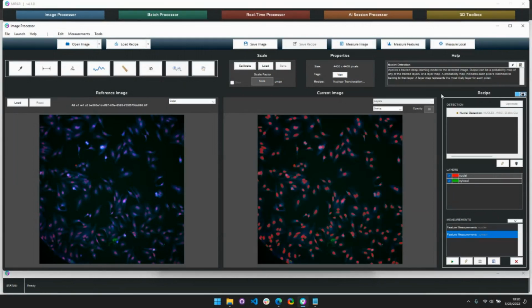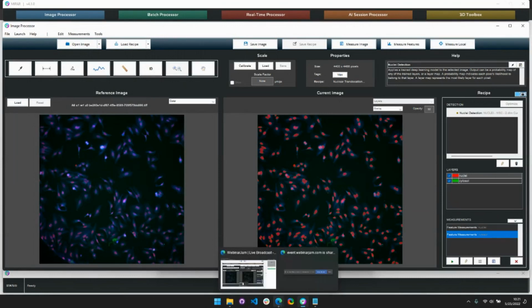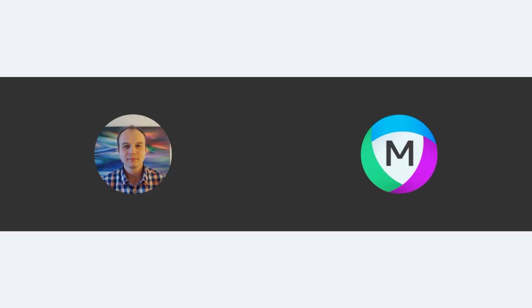You're also free to explore putting together more complex assays, right? You're no longer bound to hoping that the out-of-the-box assay that you receive will come with some image analysis solution, or hoping that somebody else has created the solution for you. With MIPAR, we're able to readily put these solutions together in a matter of minutes and execute them on your entire data set to explore your hypothesis. So let's go ahead and jump back into our slide presentation.